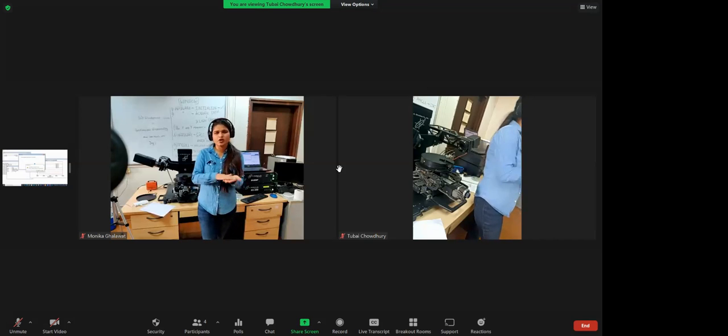Now, for any semiconductor, can we just prepare powder form and deposit? I believe it won't do, because again it depends on your particle size. If the particle size is big, it won't be optically smooth.